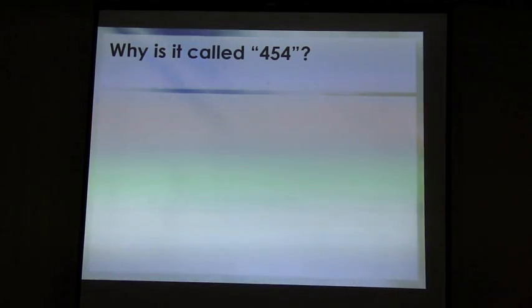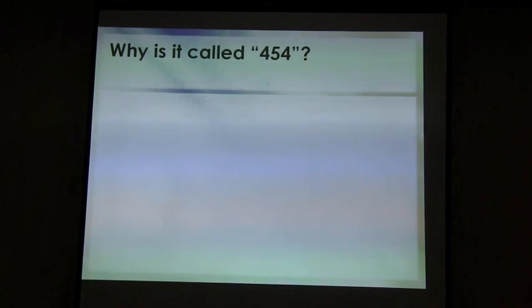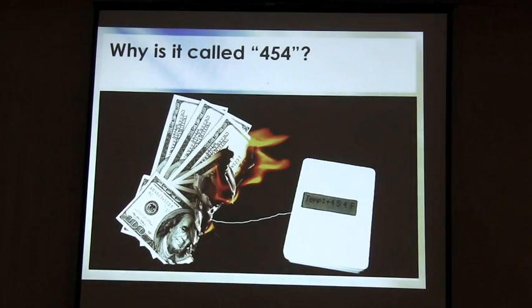Anyway, a lot of people are still puzzled about why the technology is called 454, and this explanation comes from my collaborator Rick Bushman at Penn, who we did some of our first 454 sequencing with, and he assures me that Fahrenheit 454 is the temperature your money burns at when you get into next-gen sequencing, right? So the cost of sequencing is dropping all the time, but you have to do a lot of it at once, so it's still relatively expensive to do each run.